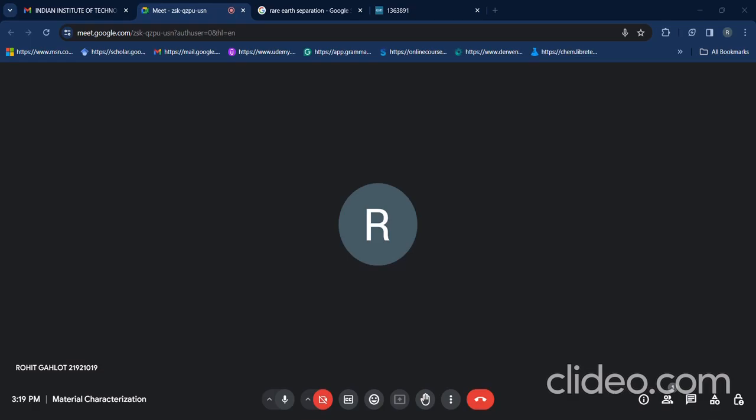Now there is one more thing I want to cover. We discussed briefly about the SAED pattern in the last class. So we will discuss indexing SAED patterns. Firstly we select the central spot. After selecting the central spot, we measure the distance between the central spot and other nearest spots.